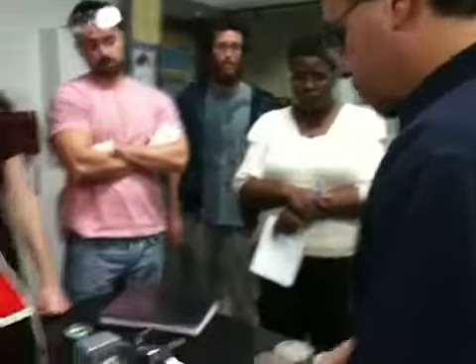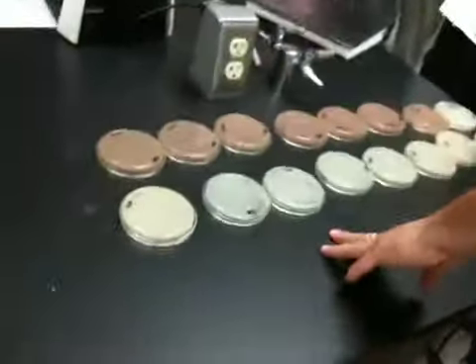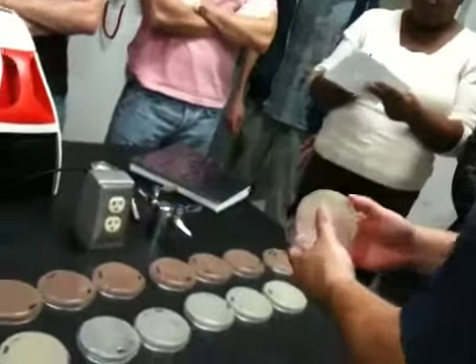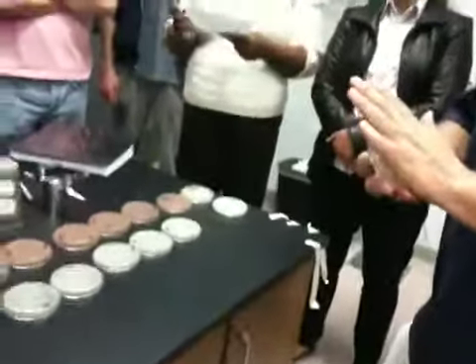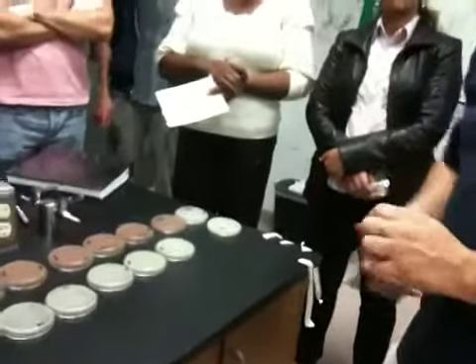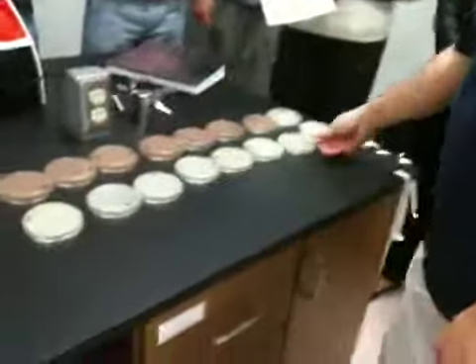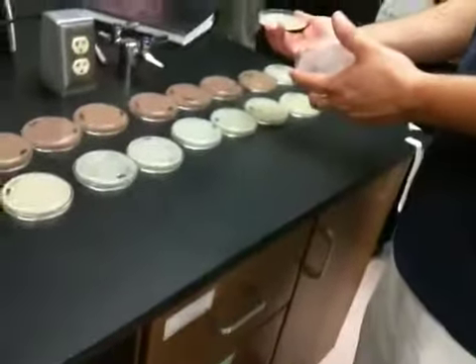Are you with me? At 2 minutes it's the same process, but everything else had died, except here where we left it with the lid and it grew crazily. Remember that when UV is being hit, plastic and glass stop it completely, and we talked about the glasses when people go skiing or go to the beach. Okay? But you can see when we took off the lid, it just didn't grow at all.